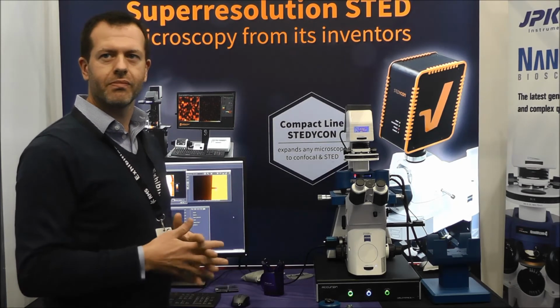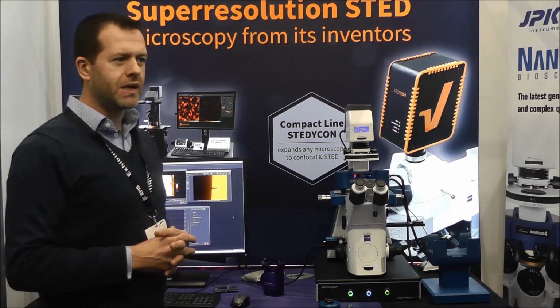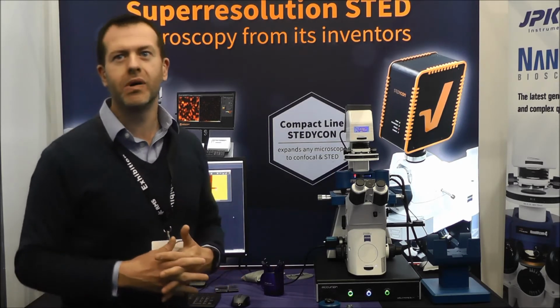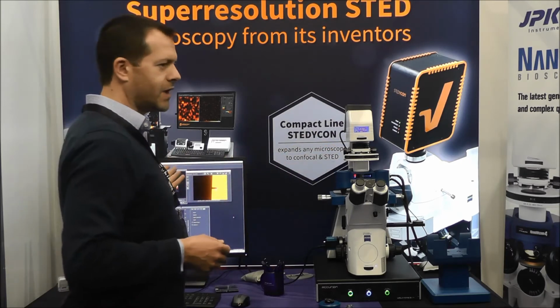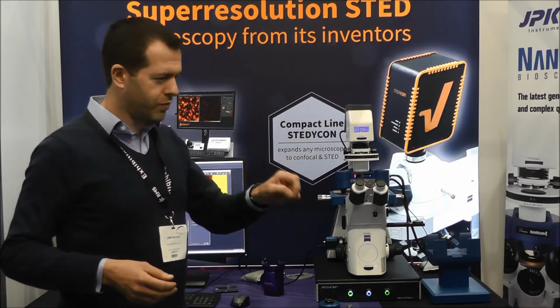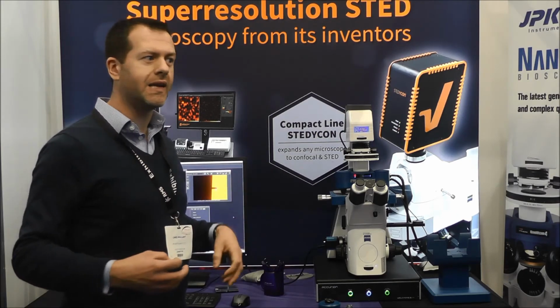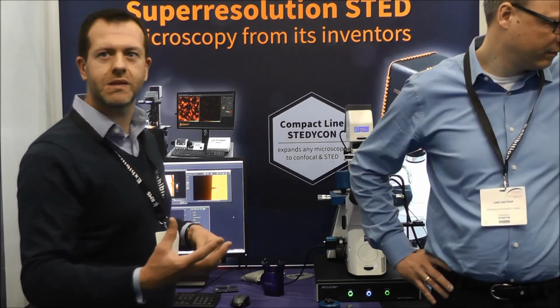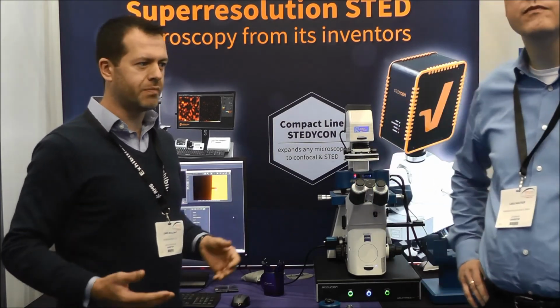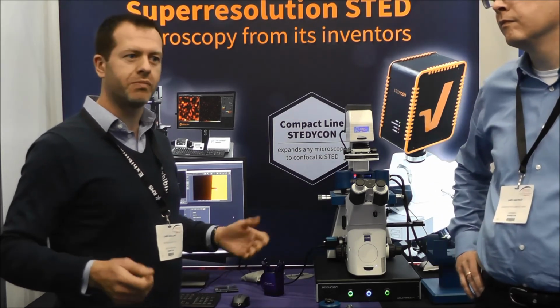And that must be really making people's lives a lot more straightforward. Well, I think people like to see different techniques combined. It's novel, certainly with STED. Having that overlaid with an actual physical interaction of the sample, where we're looking at nanomechanics, and they're looking at fluorescence of certain parts of, say, a protein being expressed on a cell, it gives a perfect, novel set of techniques to look at people's research.